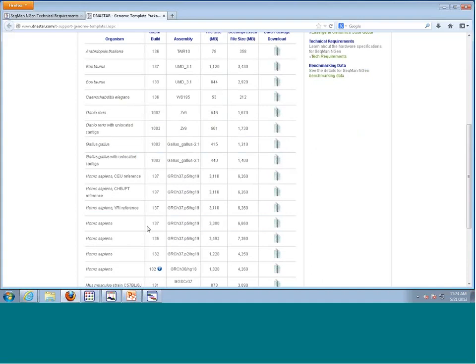And the advantage there is we have all the annotations with the GenBank files, plus all the dbSNP information. So that information can pass through our assembler and go into our output file, our BAM file. So we can do statistical SNP analysis on the fly as data is streaming through, and then have all the feature information to really facilitate our analysis.